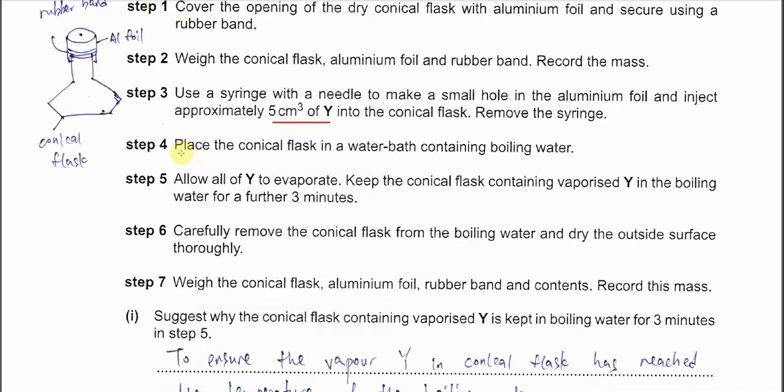Now, step 4: place the conical flask in the water bath containing boiling water. Boiling water means the temperature is 100 degrees C. Allow all of Y to evaporate, so the volatile liquid Y might evaporate. Keep the conical flask containing vaporized Y in the boiling water for a further 3 minutes. Once it's vaporized, we still need to put it in for a further 3 minutes in the boiling water. Make sure all of it forms gas.